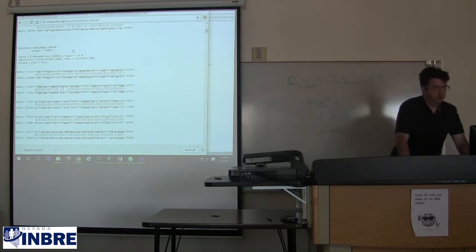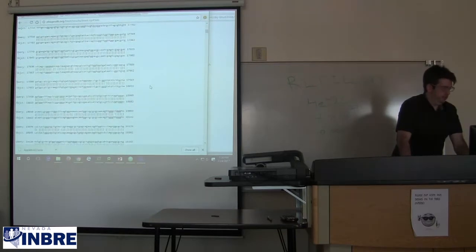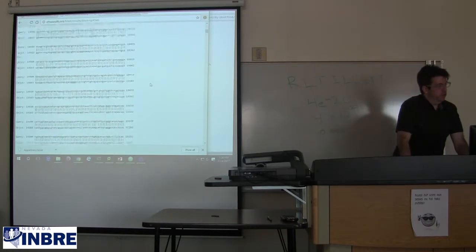It's either 400 more or 400 less than our Apple Tree 2. 99% identity, all but 200 sequences, 18 gaps, and we can see that the largest local alignment between the two starts at 15,000 and I think goes to 40,000, so we could be scrolling for a while.